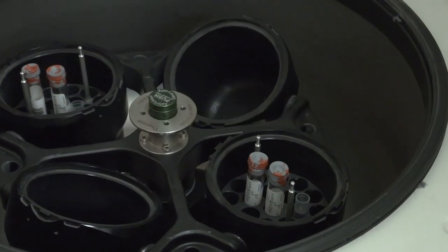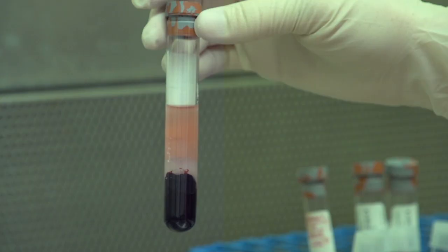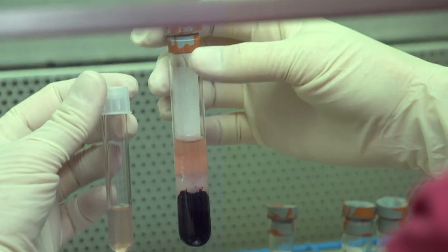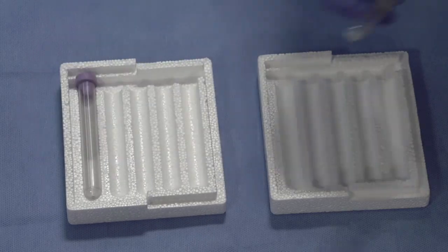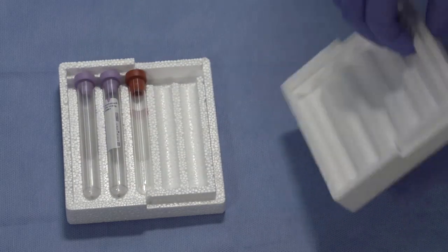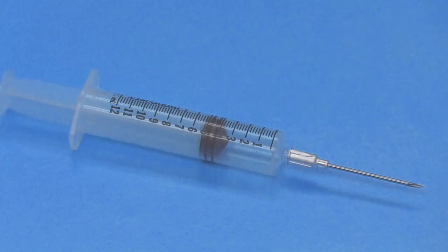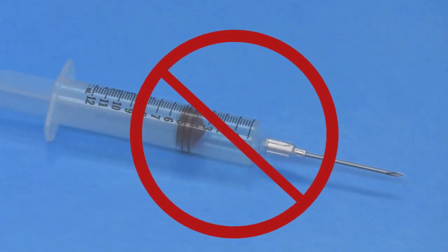When submitting serum samples, please allow the blood to clot, spin down the sample, and collect the serum for submission. This will allow you to assess the degree of hemolysis and/or lipemia present and results in a stable sample. Multiple blood tubes are packed to prevent them from banging together in transit. Individually wrapping the tubes, using a styrofoam tube mailer, or reusing the packaging that the tubes came in will accomplish this. Do not send any blood samples in a syringe with or without a needle attached.